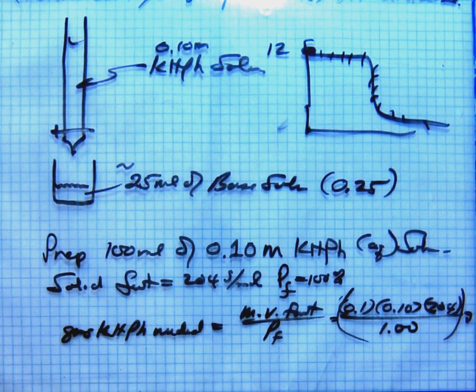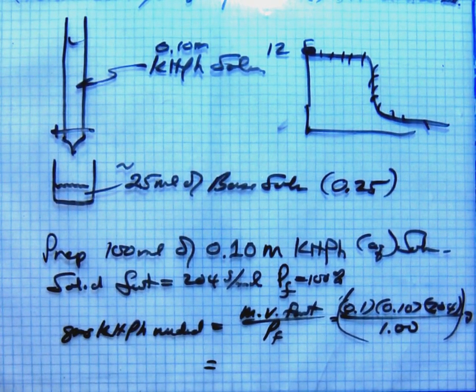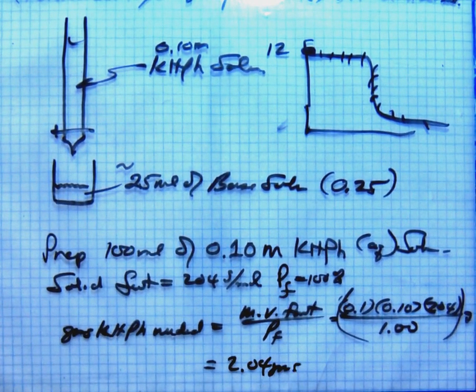I've got a 100 milliliter volumetric device that you can use to make a very accurate prep here. That's 2.04 grams. Now that's easy to measure out, okay?